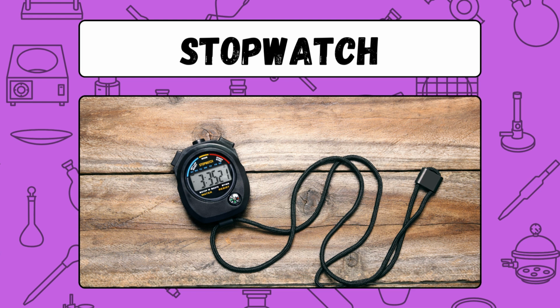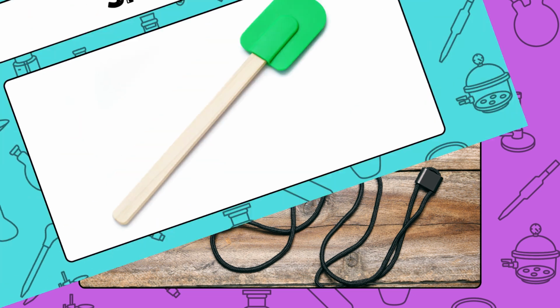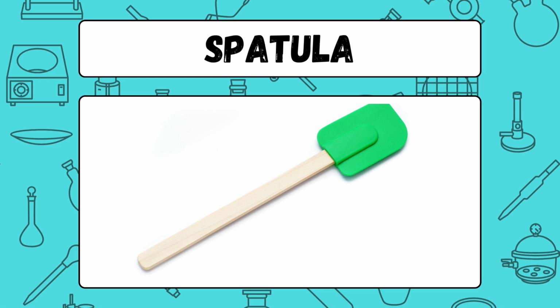Stopwatch. A stopwatch is a handheld timer used to measure the duration of an event or process with high precision. Spatula. A spatula is a flat, small tool used for stirring, scraping, or transferring substances in a laboratory.